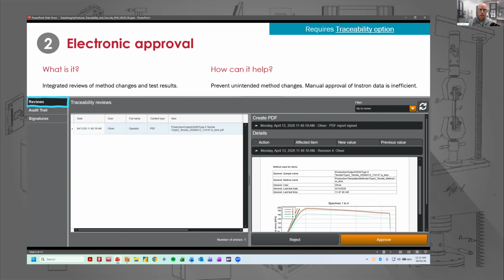It could be happening in a completely different business system where files are managed and approvals are made, and that's actually a pretty sufficient way of doing it. But a lot of times, it's just a manual process: physical sign off, physical filing, scanning, that this change was made, that this particular user made this change, and actually doing a physical signature. So certainly having the integrated approvals within traceability is a more efficient way to do this.